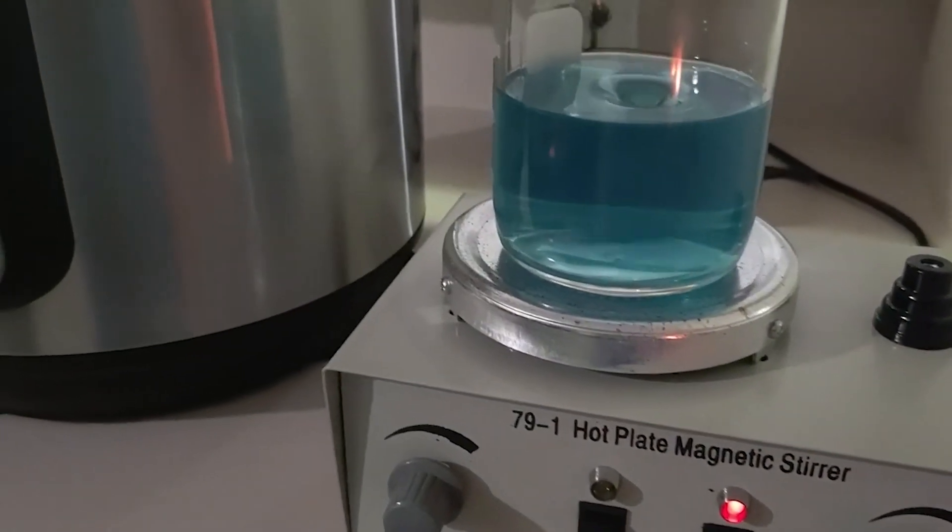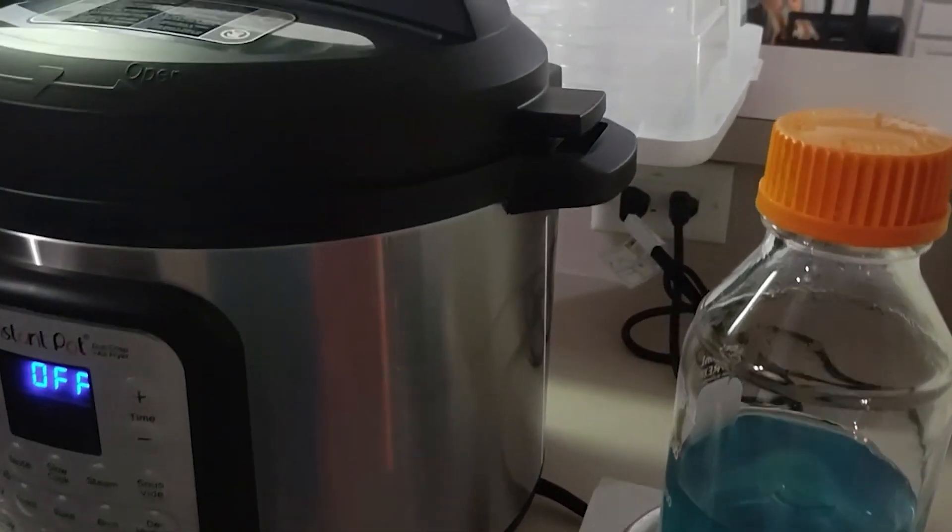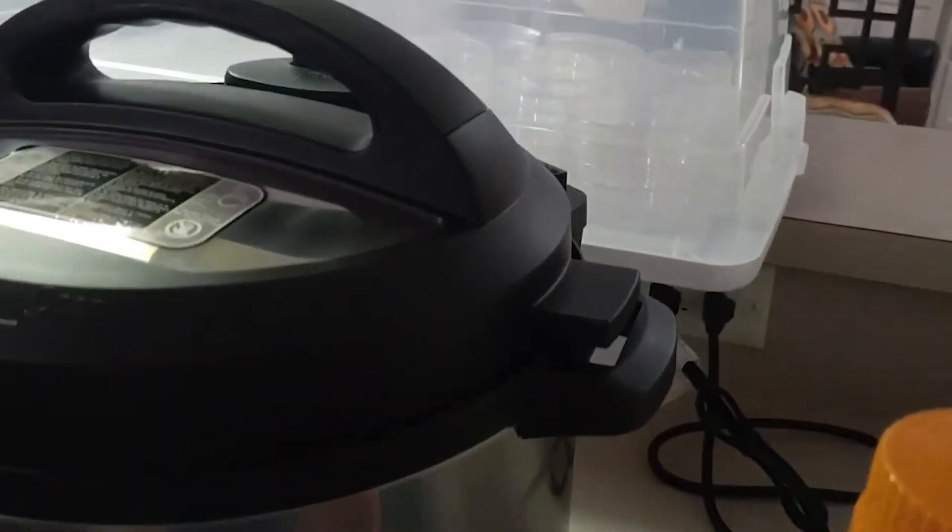Agar, agar, agar — tomato, tomato, potato, potato — no matter how you say it, we're excited to share this process with you.